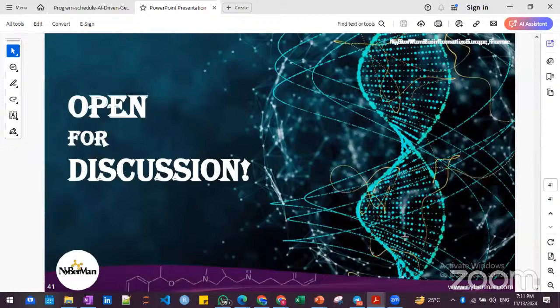You will also learn this when you practice. You will know these keywords, that if there is flow cell number information, sometimes the tool will tell you that the at-the-rate symbol is missing or something. Even if the tool is not telling these things, and it is just throwing an error, an unsuccessful run, you still have to go to your data and make sure that your data is totally fine. There are programs to check that your FASTQ structure is fine. Only if you are totally sure that your file is fine, then you skip to the next tool.